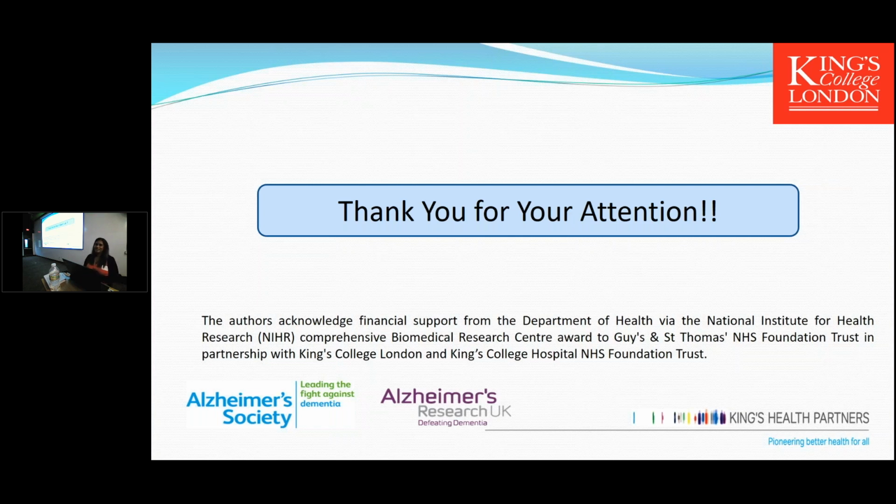Have you found, in, say, control mice or mice given some agent, a big difference? So if we give the mice what agent? Well, that's obviously the next step. So the question was, have we fed our animals or given them a copper chelating agent?